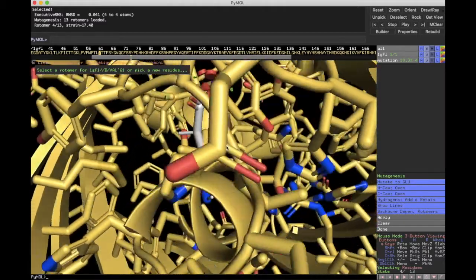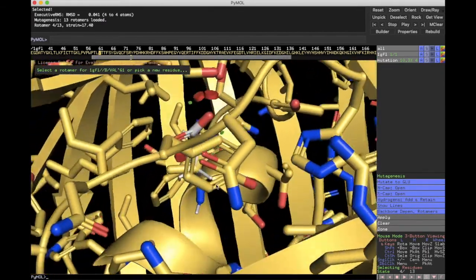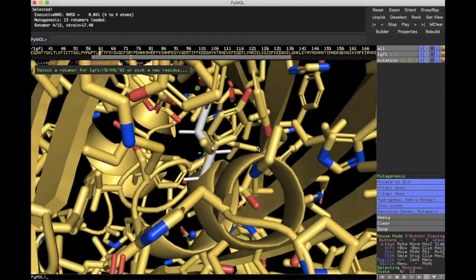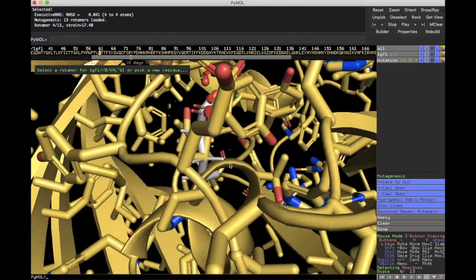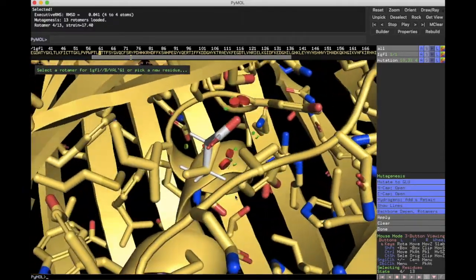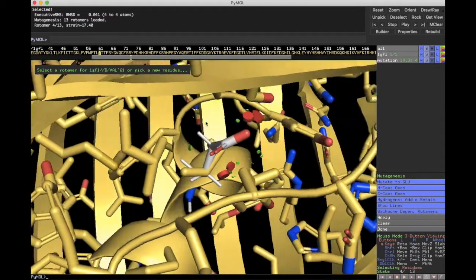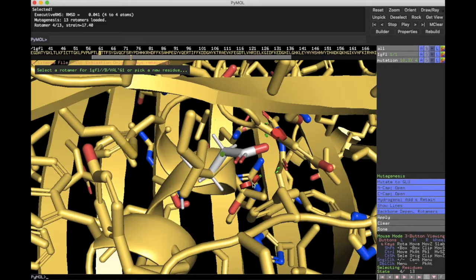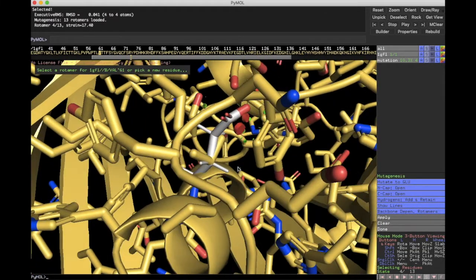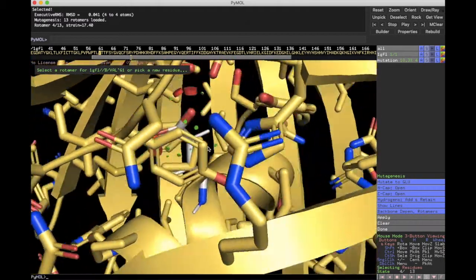And you can see, look at all these clashes that are happening here. We've got this giant amino acid now that's very close to some of these other amino acids. So there's definitely going to be a clash here, right? There's going to be a clash here. So we'll see what happens when we start sculpting it. Because you can see this is a glutamate, okay? So we'll keep it at this one here.